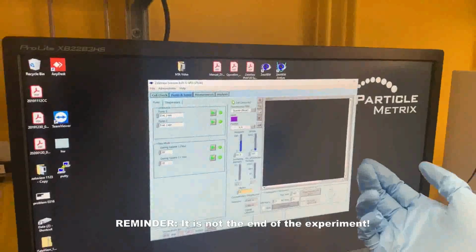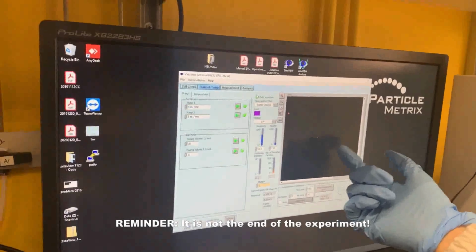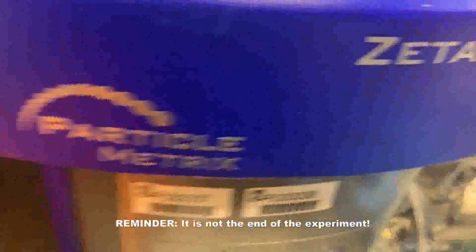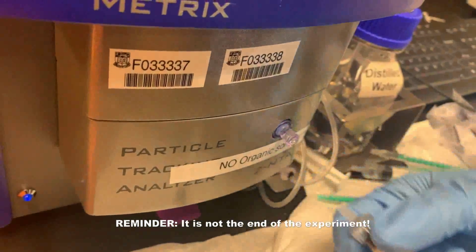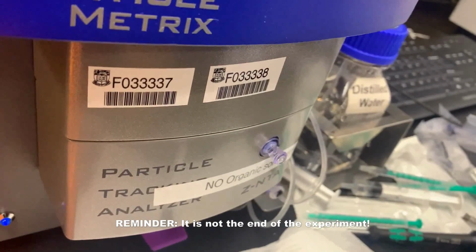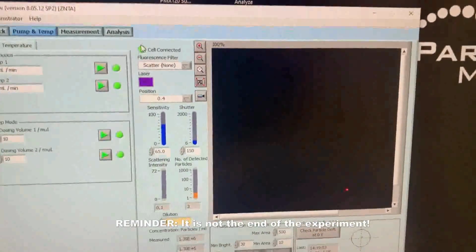When finishing the experiment, the criterion is that you have to make sure the whole screen observed by the microscope has no obvious particles inside the solution. So if there is still some scattering, keep injecting the clean water. Make sure the screen is as clean as possible. The whole screen is black.